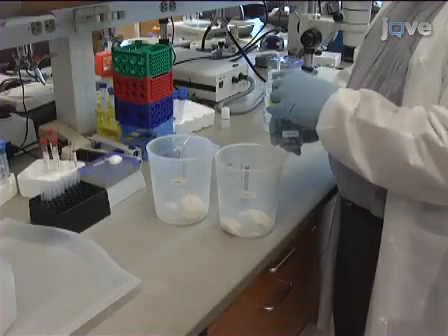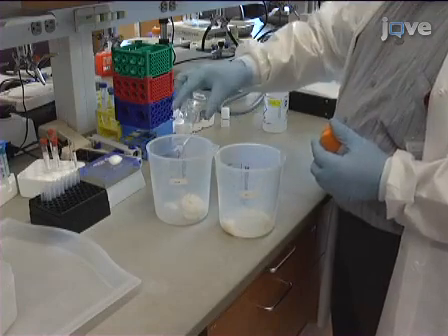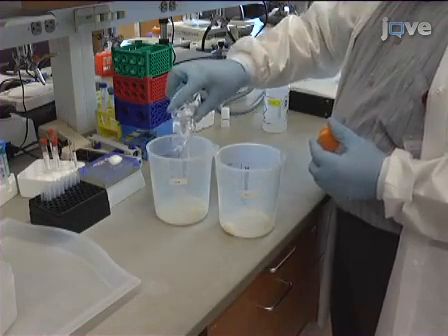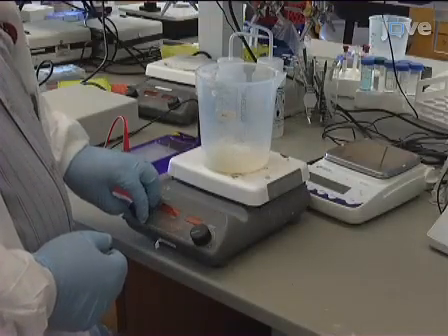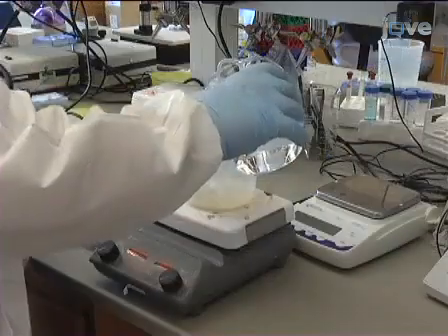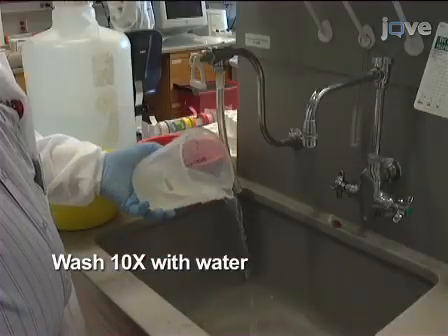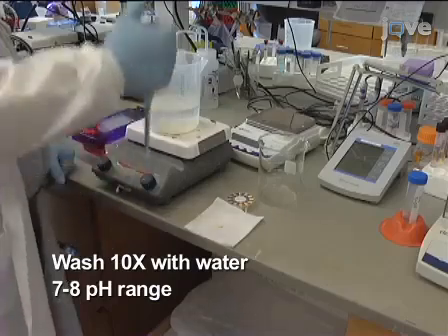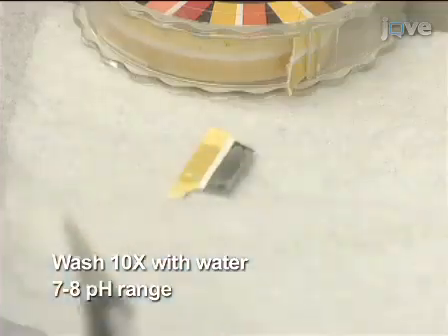To prepare the beads, add 1 normal hydrochloric acid to Ag1 and Ag50 beads separately in 1 liter beakers. Stir each flask for 30 minutes with a magnetic stirrer. After that, wash the beads with deionized water 10 times until the pH of the washings is equal to the pH of the water.